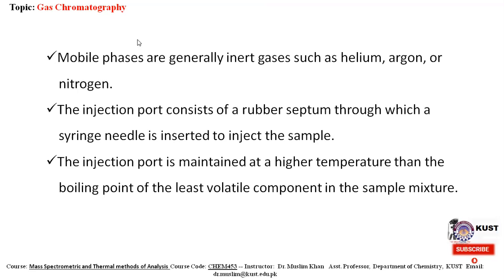This is very important: the injection port is usually maintained at a higher temperature than the boiling point of the least volatile component in the sample mixture.